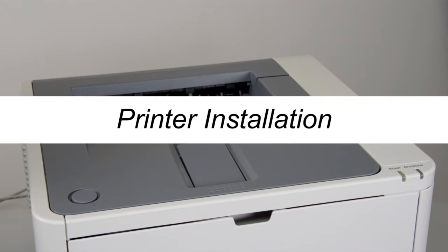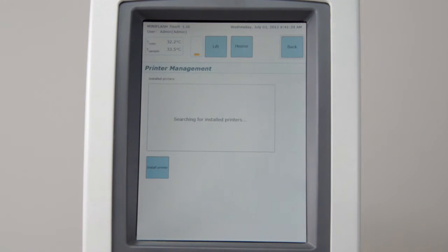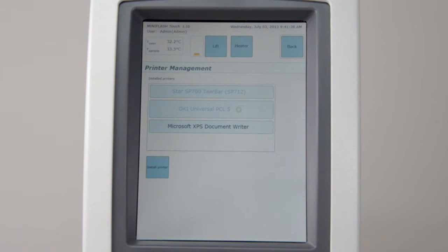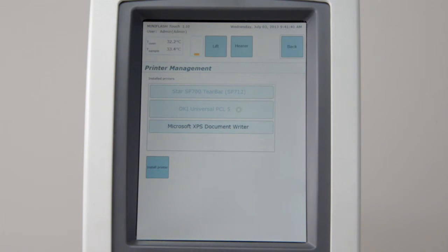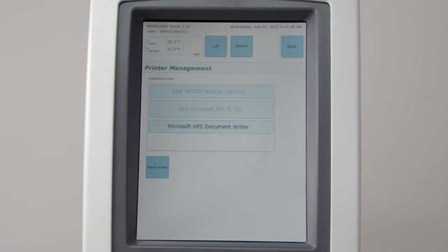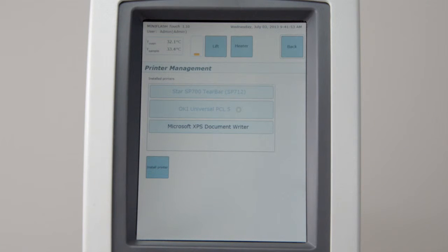Printer installation. The printer menu shows all installed and available printers. The default printer is marked with a star. To install a new printer, download your printer driver on your USB device. The driver must have INF format. A selection of generic printer drivers is available from your local representative.